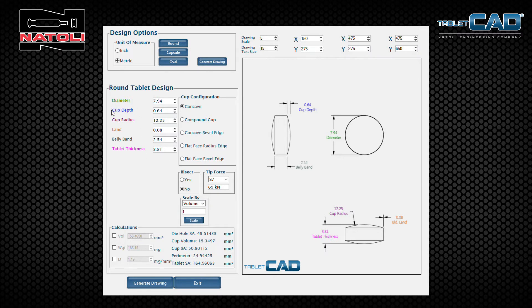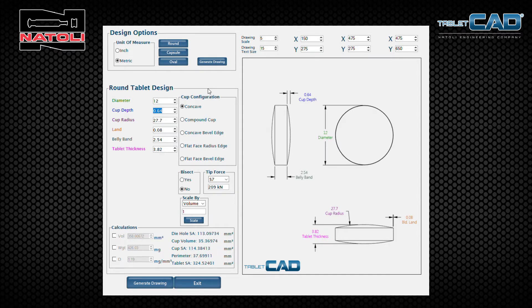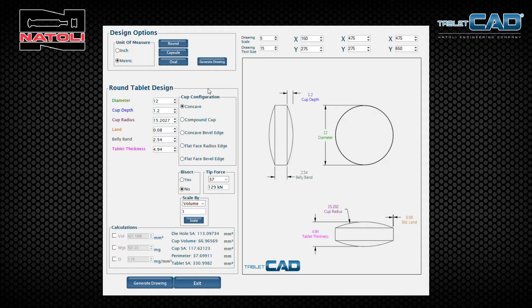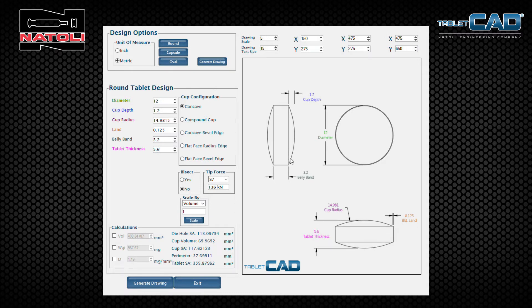Notice that the parameters are color-coded. The tablet design diameter is green, and you notice that green is displayed on the display panel as well — the same thing for all other dimensions. Let's design a 12 millimeter normal concave tablet and hit the Tab key. The Tab key will automatically enter that value and tab you down to the next field. We'll put in a cup depth value of 1.2 millimeters — notice that the cup radius modifies automatically — then a land of 0.125. Let's say the tablet thickness is 5.6 millimeters. Every time a value is entered, the display panel updates the model of the tablet.